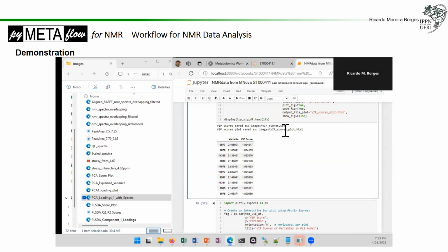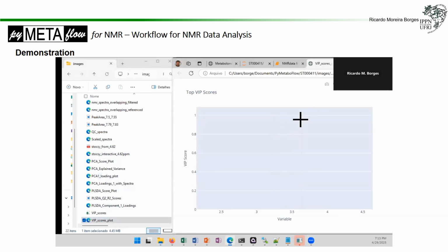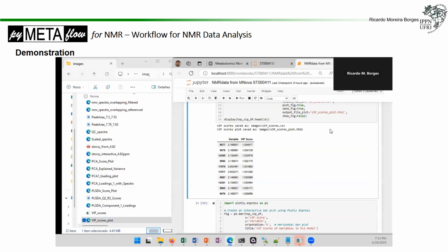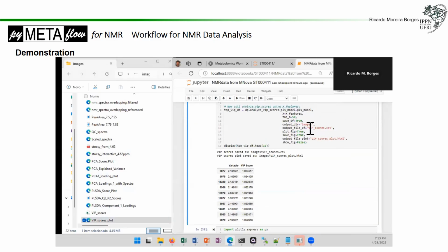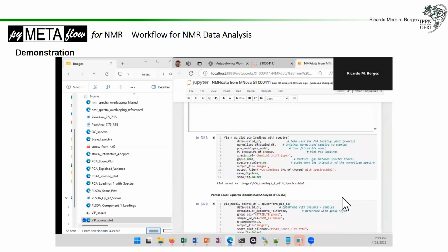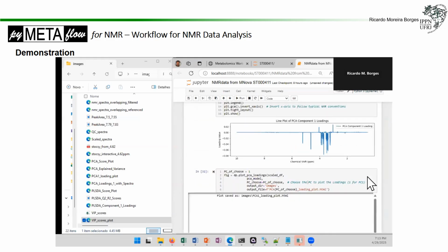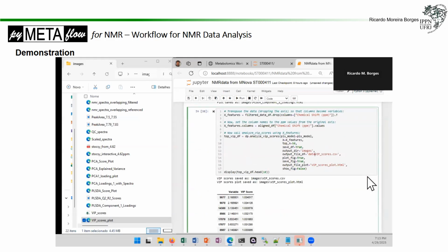This is save it on here, score plot. Okay, that's not a good plot. I have to make it better, right? And here we can do data and that, just to make sure it will save on the data folder. Okay, that should be that one.